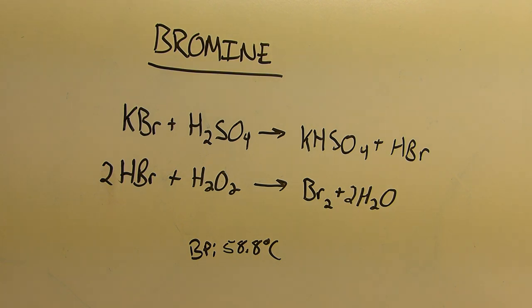Hi everyone and welcome back to the laboratory. Today we'll be manufacturing elemental bromine using a readily available bromide salt, in this case potassium bromide. It's found as a pool spa brominator. It's used as an alternative to chlorine for keeping bacteria levels down in pools and spas.